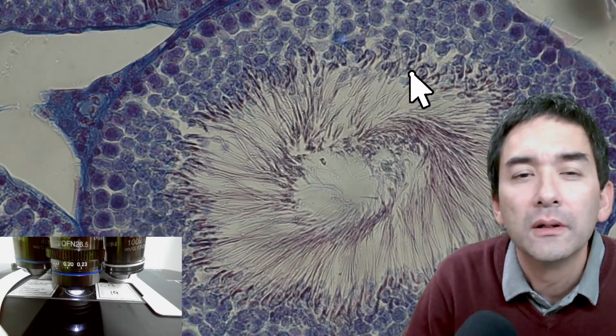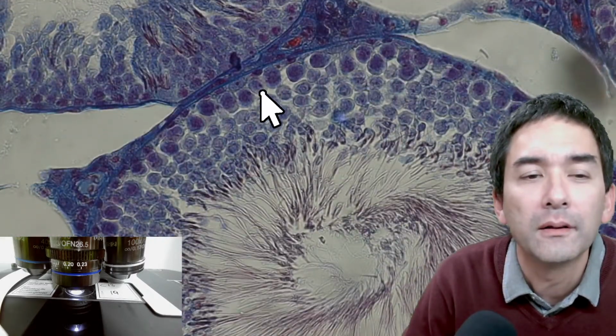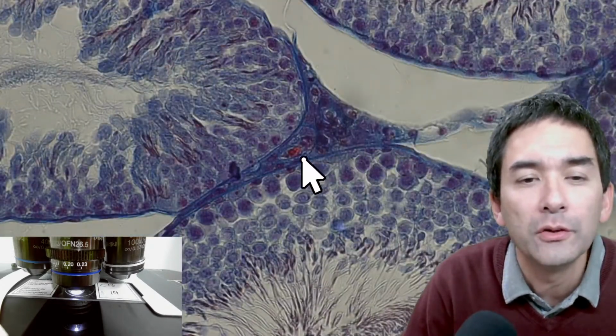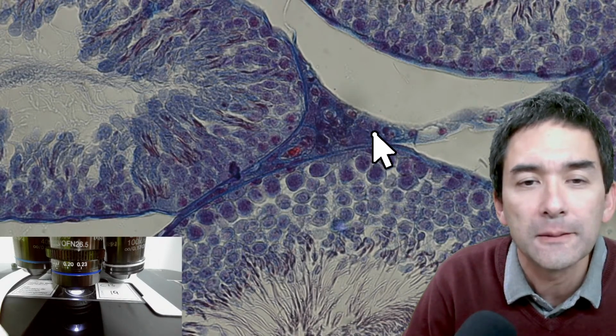Yeah? I know a little bit more about this one here because this is something that I have to teach in biology. Another thing that you see over here, notice over here, are the so-called interstitial cells.